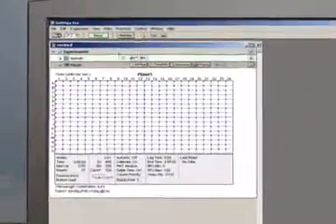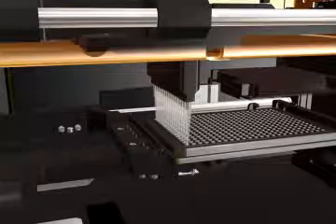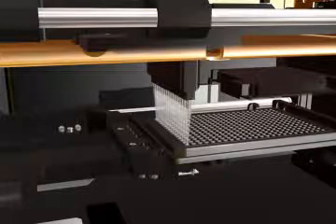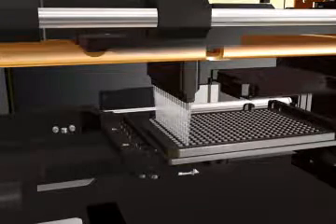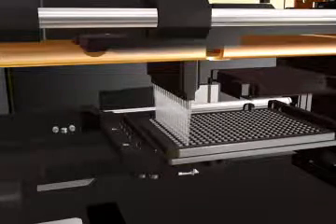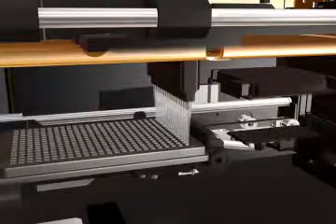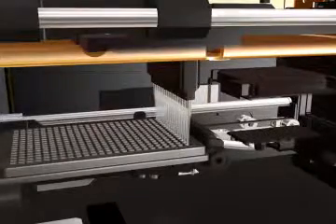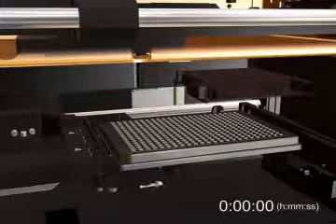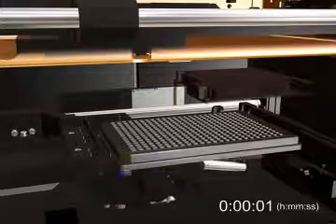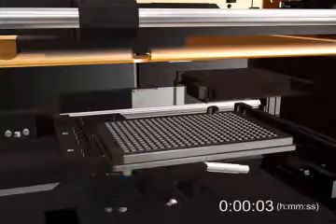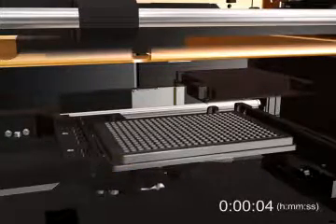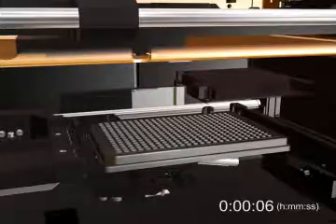Automated pipetting ensures consistent addition times and minimizes pipetting errors. Here the instrument is pipetting reagents into a 384-well plate using the 16-channel pipetter head. The FlexStation pipetter has now finished pipetting reagents into the plate and is ready to take the first reading.